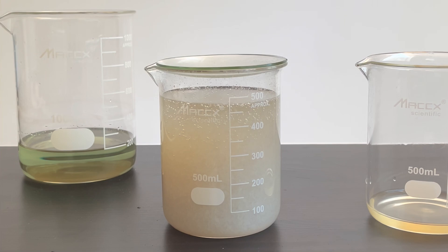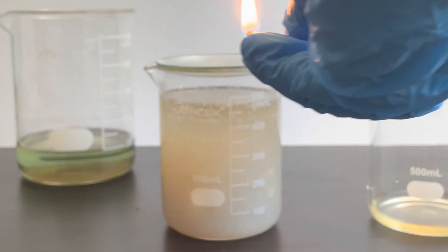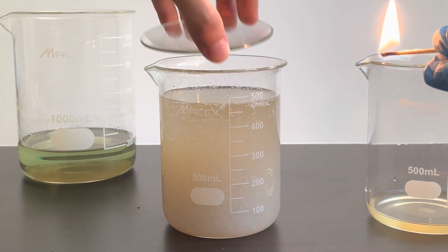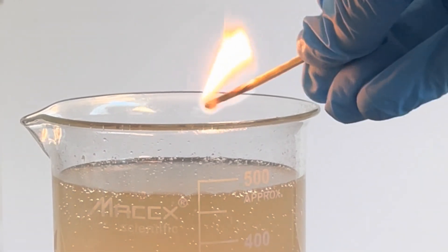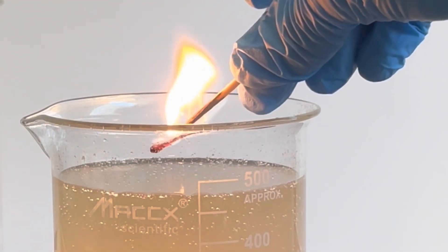It's bubbling quite a bit, so let's see what happens when I light a match over it. These little popping sounds combined with a slight orange flame could indicate hydrogen was formed.